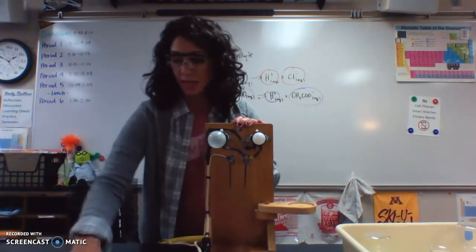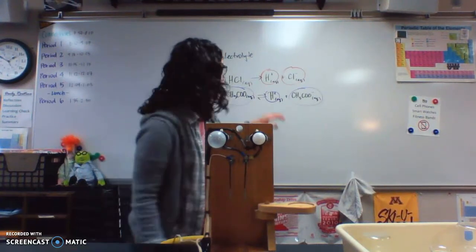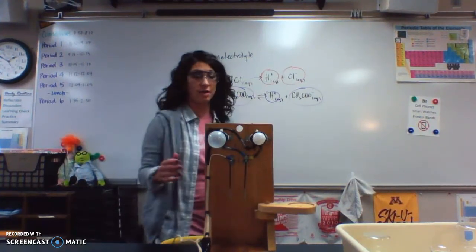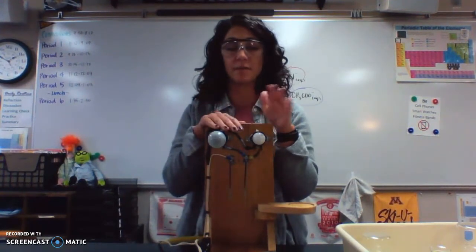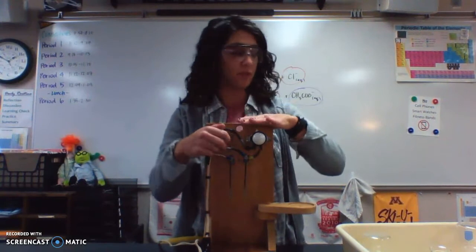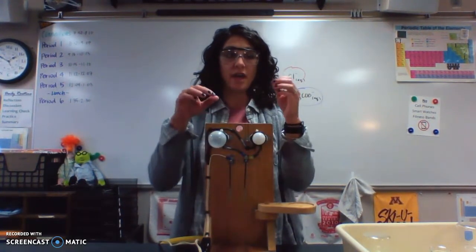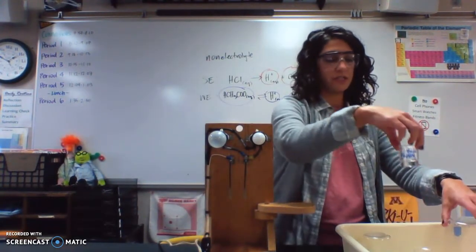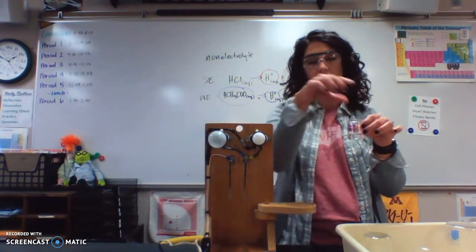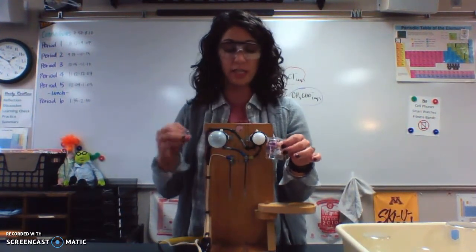Okay. Our next two are both acetic acid. Now acids, like hydrochloric acid, acids are made of ions. Remember the cation in all acids, at least for now, is going to be hydrogen, and then we have some anion with them. So acetic acid, we have hydrogen, and then we have acetate. So I'm first going to do what's called glacial acetic acid, and you might want to make note of this. Glacial means it is pure, like there is no water. This is pure acetic acid.